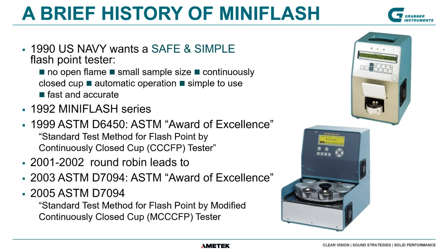Sorry for that. History of the MINIFLASH started basically by the need of the US Navy, who wanted to have a safe and simple flashpoint tester, and approached Dr. Grabner to design a flashpoint tester which they can bring on ships, for example, and test if something has happened to the ship fuels. And then we came out with the first MINIFLASH series, single and 8-fold sampler.